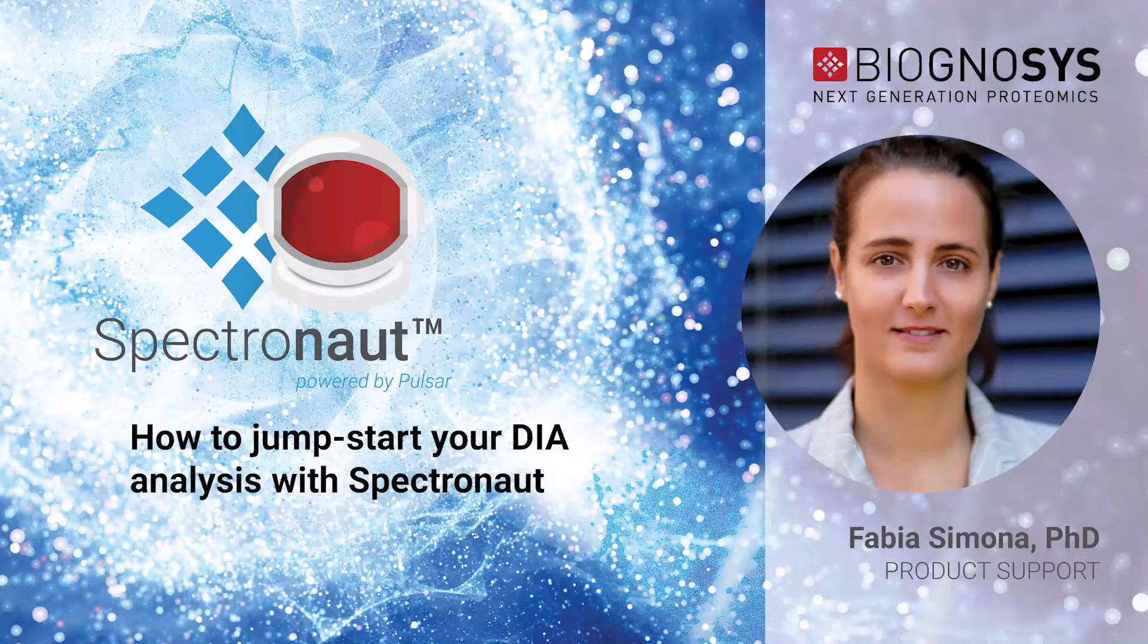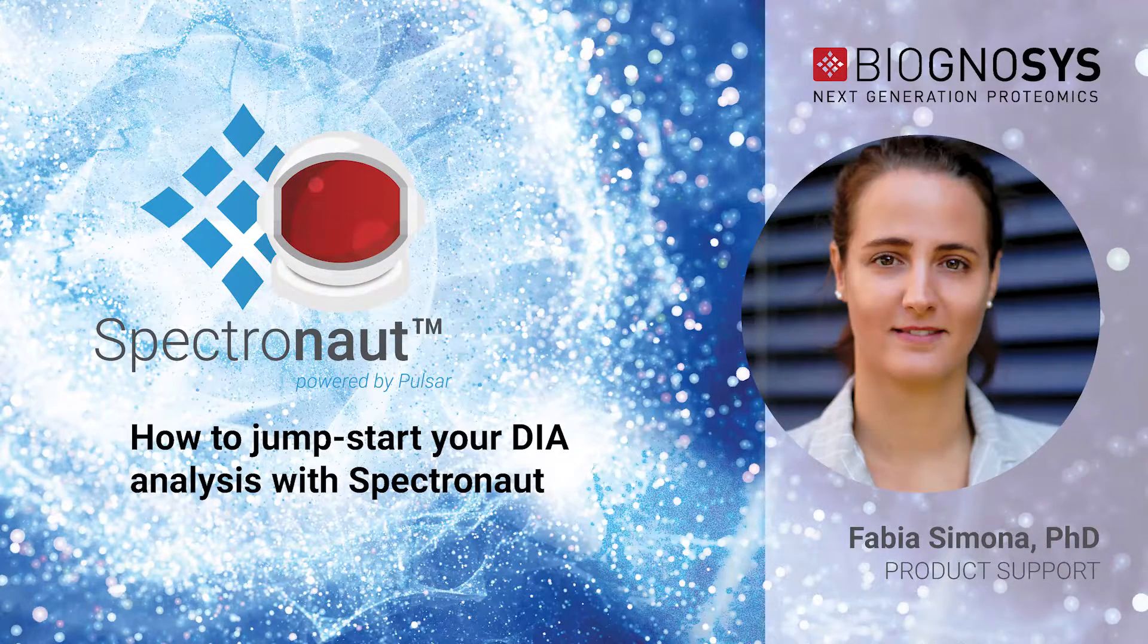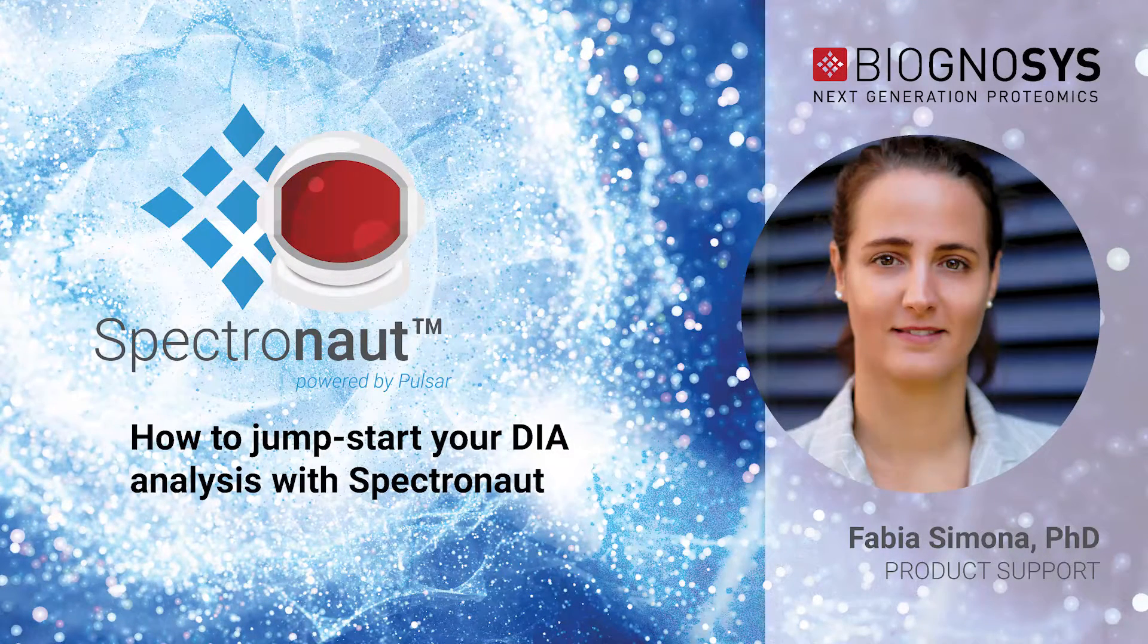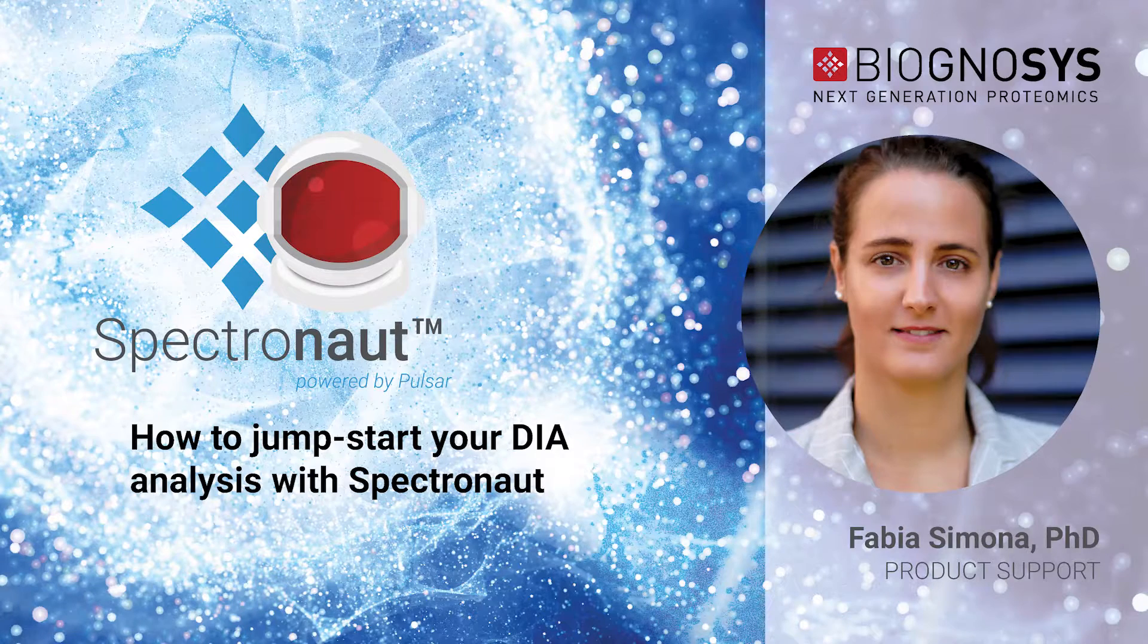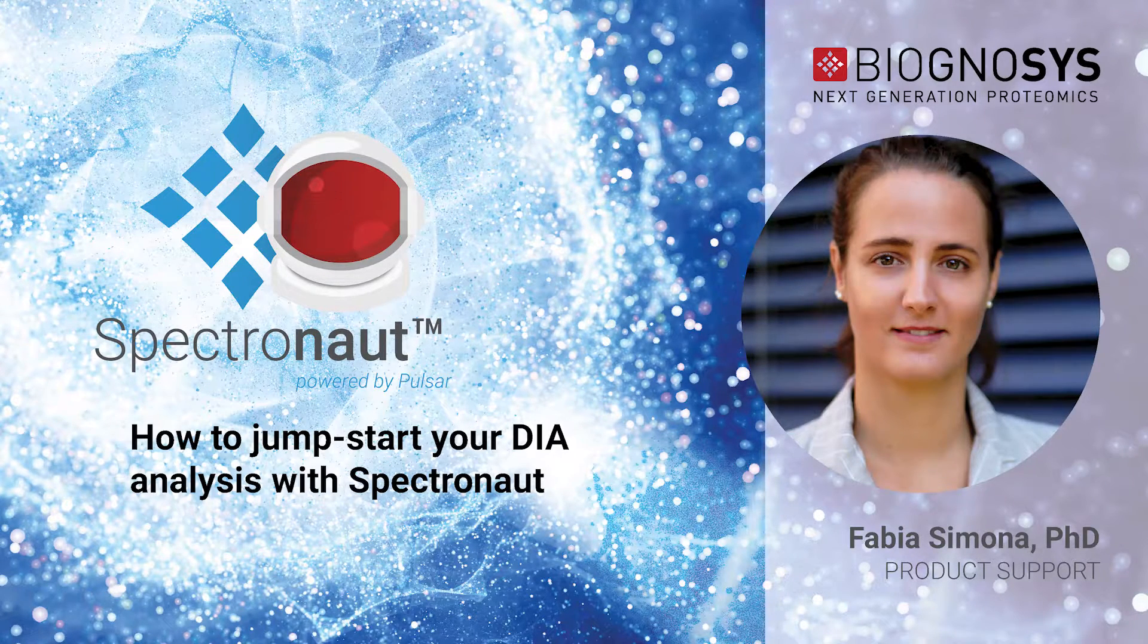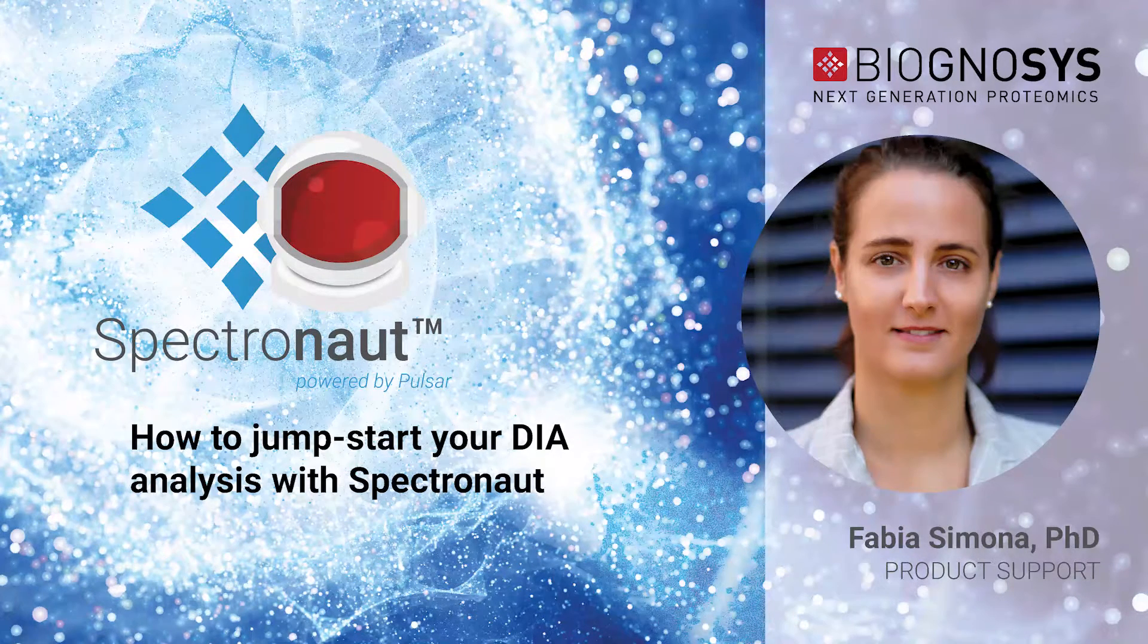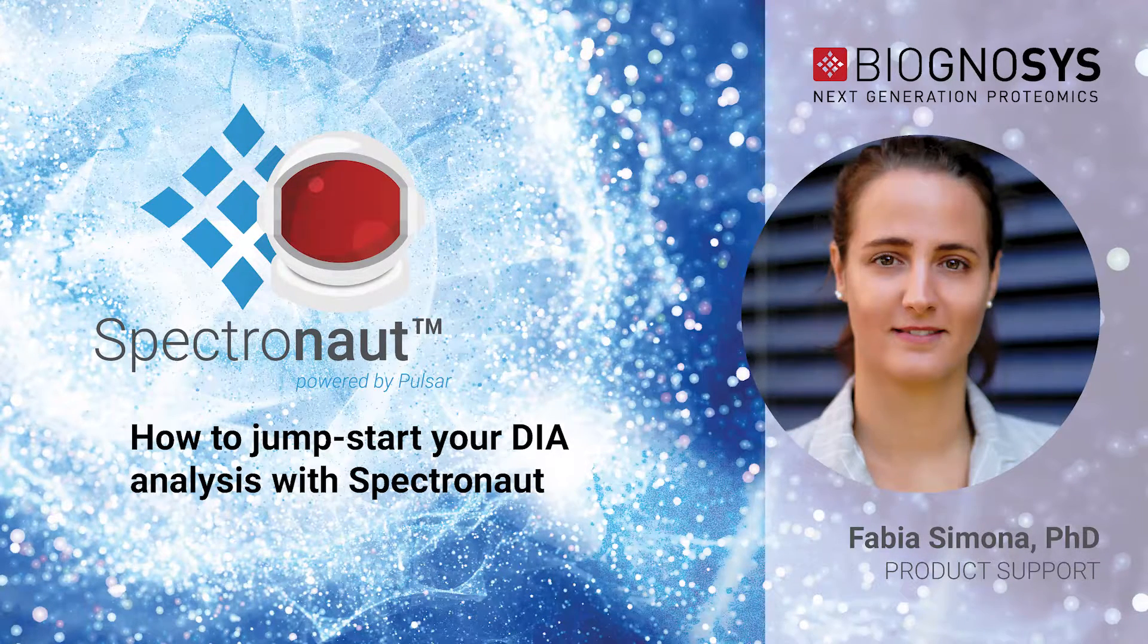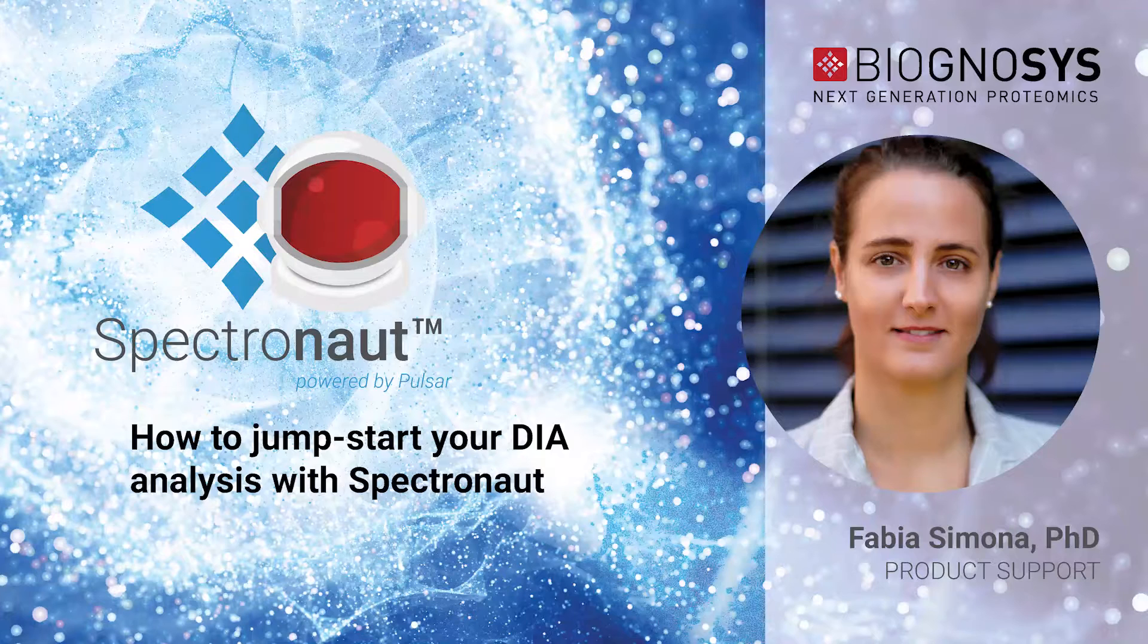Hello, my name is Fabia. I work in the Biognosis Product Support Team, and today I'm going to show you how to jumpstart your DIA analysis with Spectronaut.